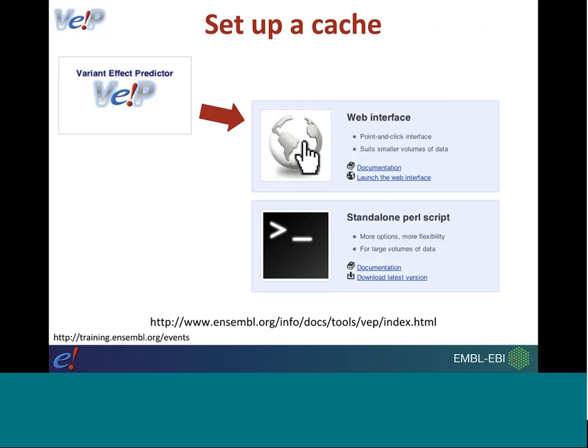So we can use the VEP in two major formats. You can also use the REST API as well, but we like to think of the web interface as being the most user-friendly option, so it doesn't require any computer programming knowledge or script writing. So this is what I'm going to quickly demonstrate to you now.